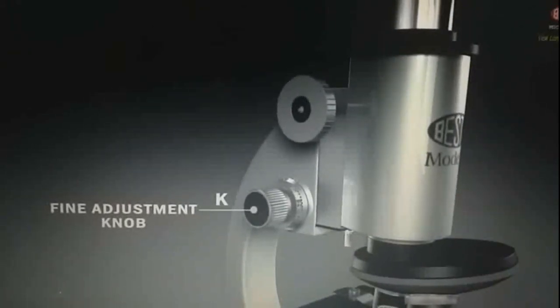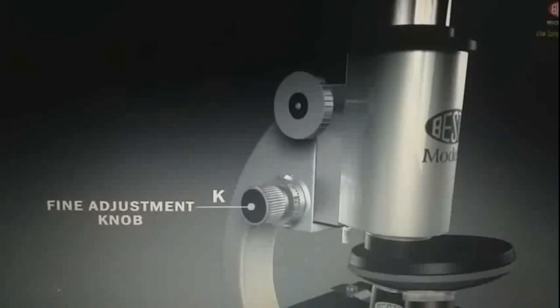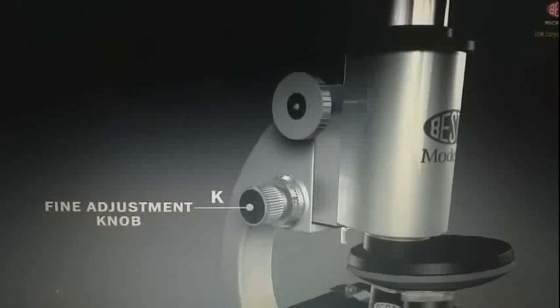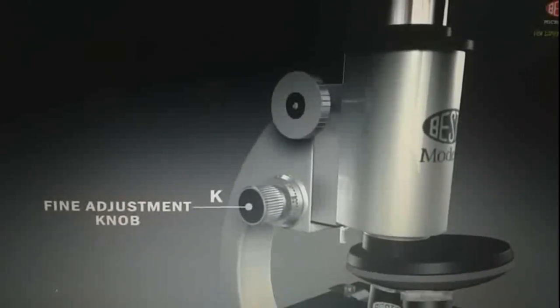K, fine adjustment knob. It is the small knob used to change the position of the body tube by making small adjustments to the focus of your sample.